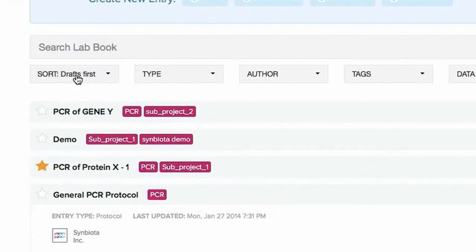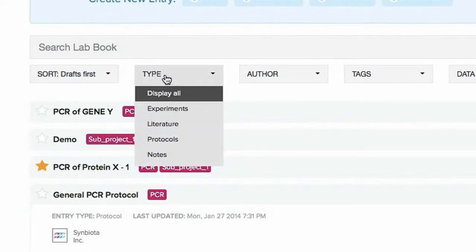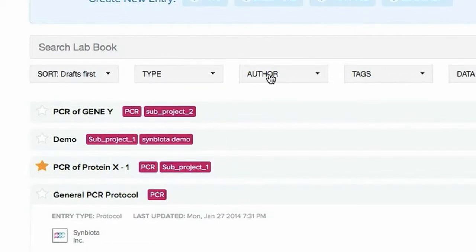You can also sort by entry type such as experiments, literature, protocols, and notes.